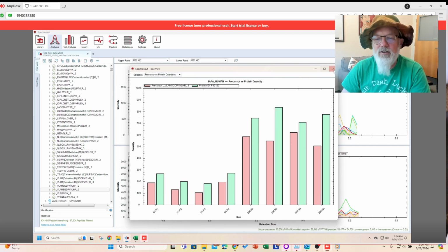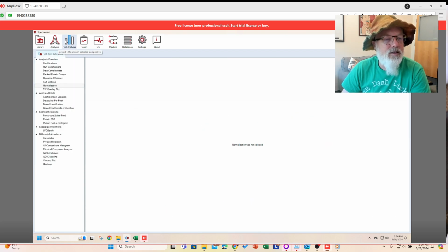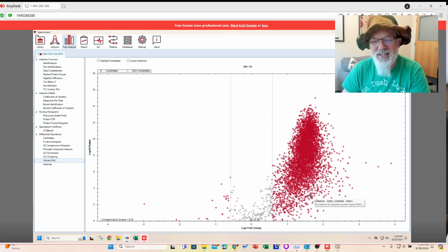And let's see how close we were. Let's look at the LFQ bench here. Let's see if it changed the principal component analysis. Sort of, maybe the 200s are clustering. It's hard to say because it's a relative signal, right? So let's look at the volcano plot. You would expect, boom. When you're non-normalized, this is exactly what you would expect, right? You'd have everything pushed in one direction.